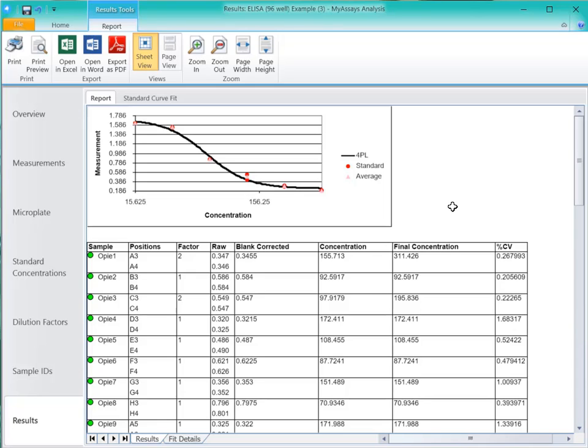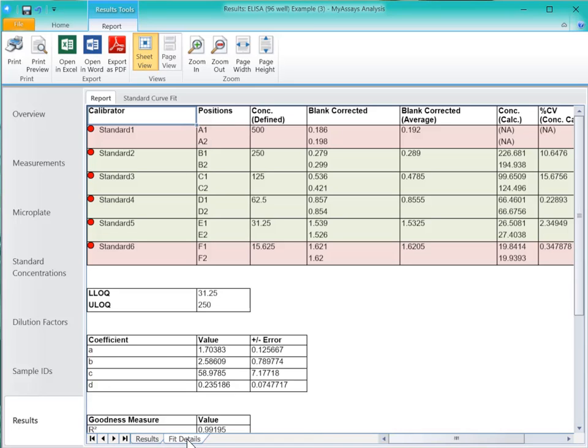On our report, you can see two different sheets. The first, Results Sheet, contains our results, and the second, the Fit Detail Sheet, contains our fit details.